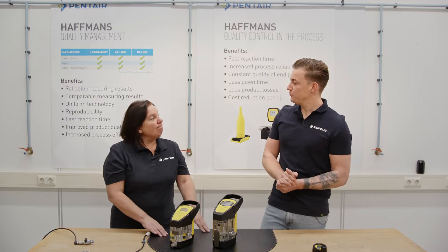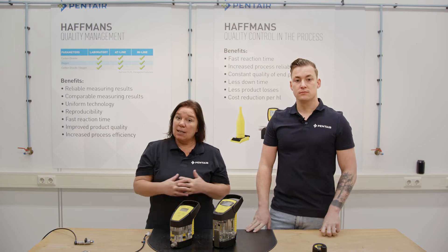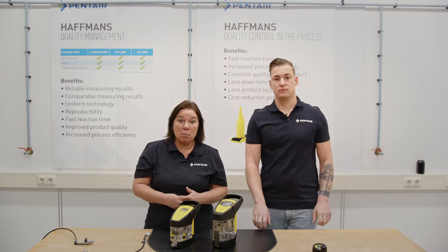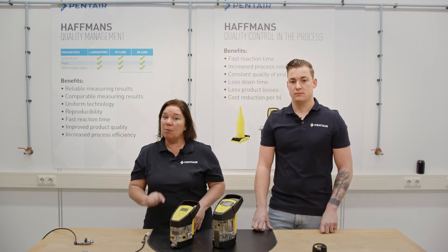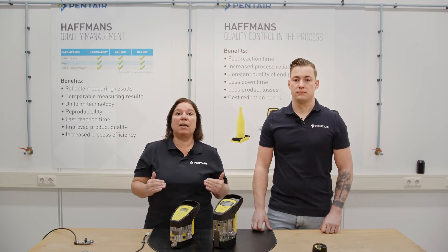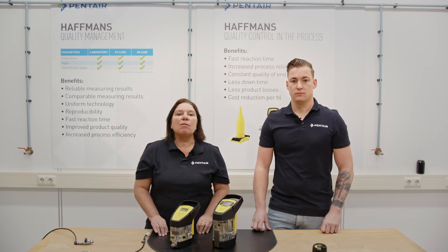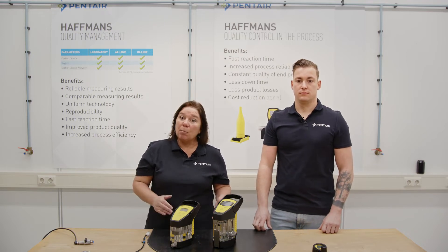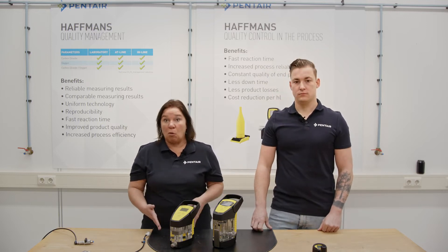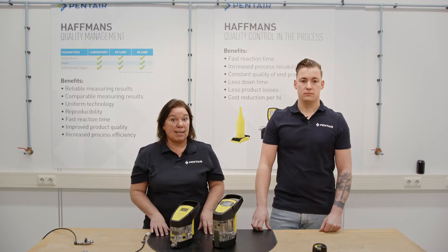So what kind of tools do we need? We need certified calibration gases like nitrogen class 5, which means 99.999% purity and thus almost having no oxygen — less than 10 ppm. When also calibrating the high point you will need a gas containing 1% oxygen or 4%, with an accuracy better than plus or minus 1%.